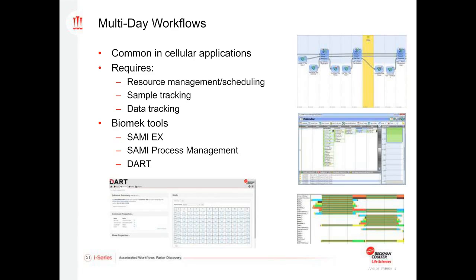So when automating these types of approaches, there are a number of requirements. One main one is that you need to have good resource management and scheduling. And this comes back to our SAMI EX software, where, when you're processing multiple plates, it will find the most efficient way to process those plates in a batch-wise fashion. It also requires sample tracking. You need to know where your samples are at any given time in the workflow. And you also need to know if your Biomek will be available on a given day.